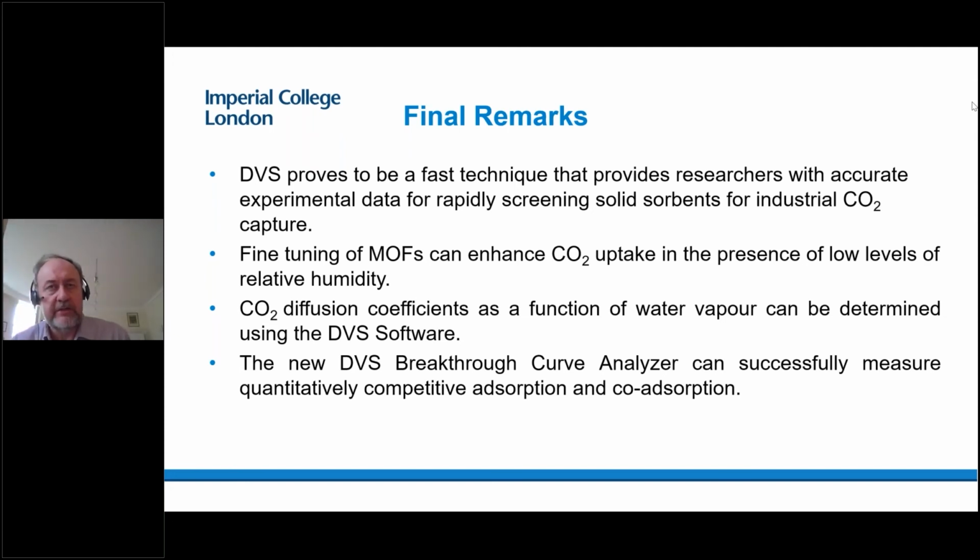It could be done, yes. Providing the liquid isn't too volatile, in other words, providing the vapor pressure is not too high, there's no reason why you couldn't create a sample with a well-known geometry, expose CO2 to it, and look at the rate at which CO2 dissolves and diffuses. So in short, you could do that, yes. If you said to me, have I got data to show you on that? I don't have it, but it could be done.